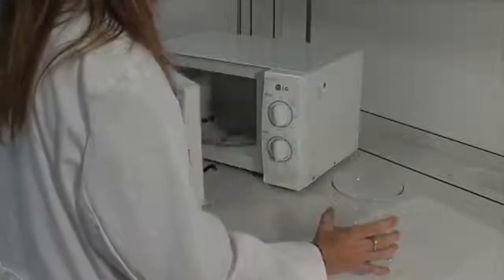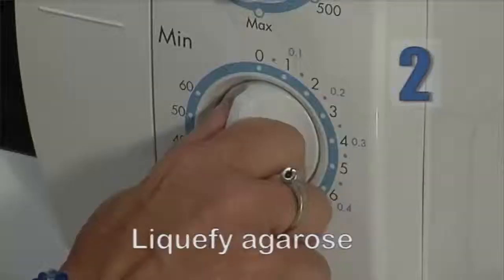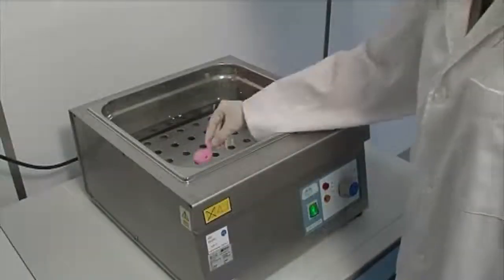Heat the Eppendorf tubes in the microwave for 2 minutes at maximum power to liquefy the agarose. Alternatively, place the tubes in a water bath with boiling water for 5 minutes.